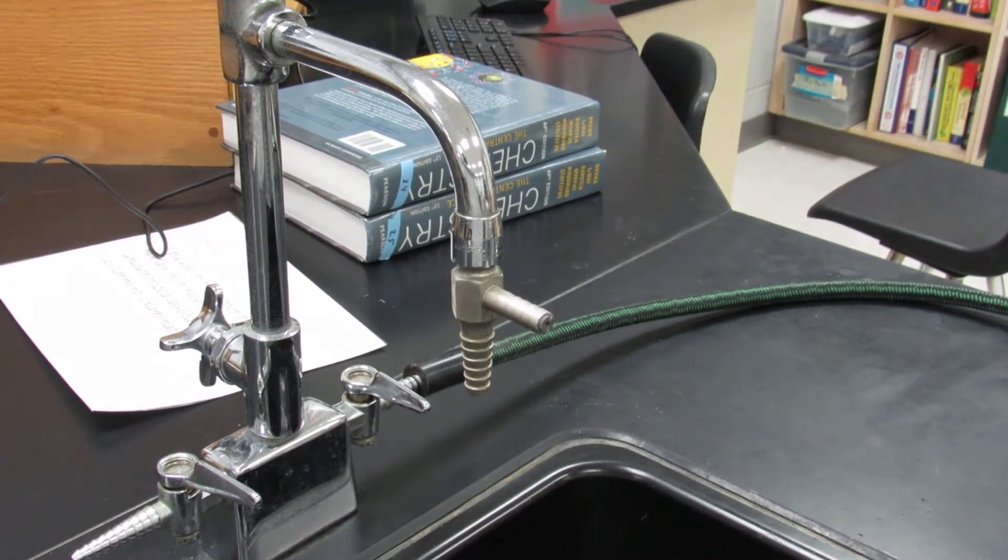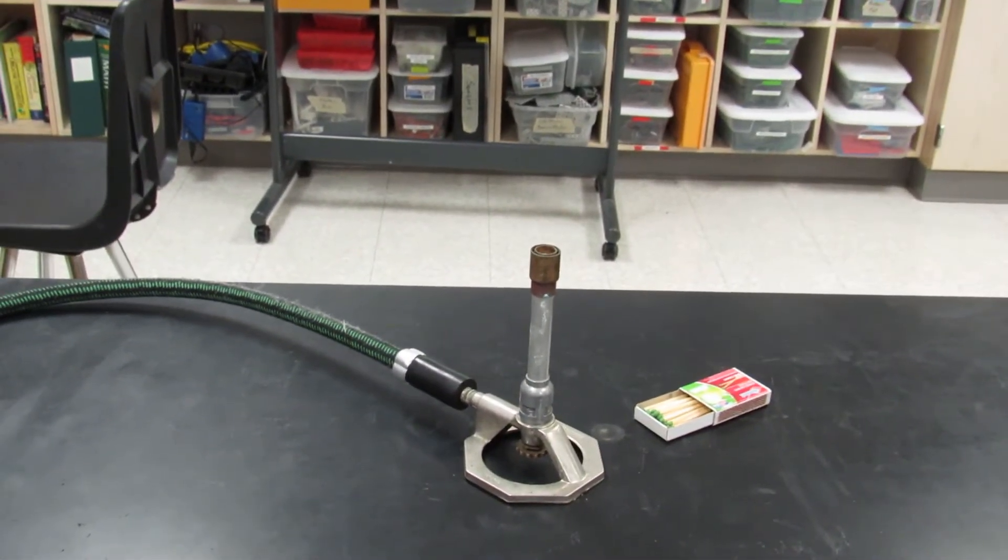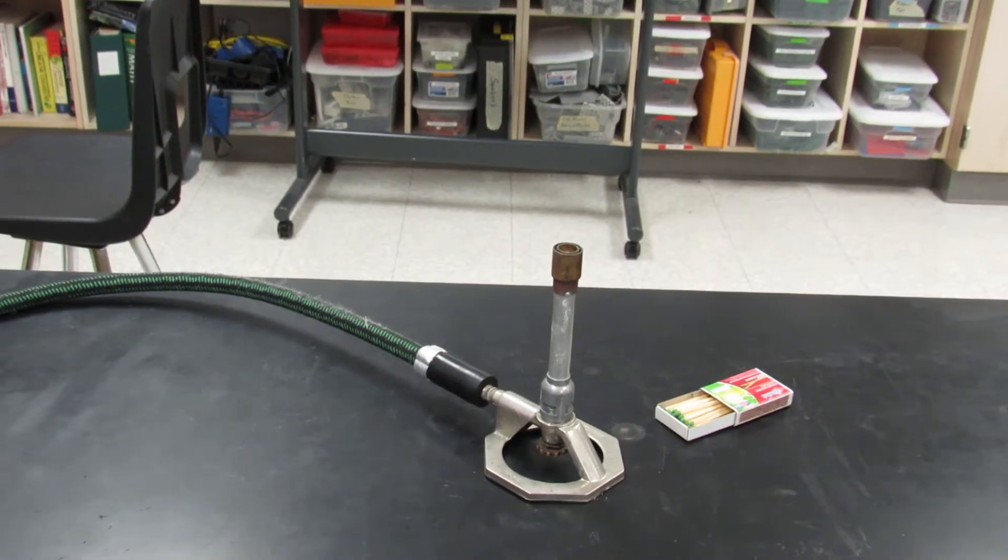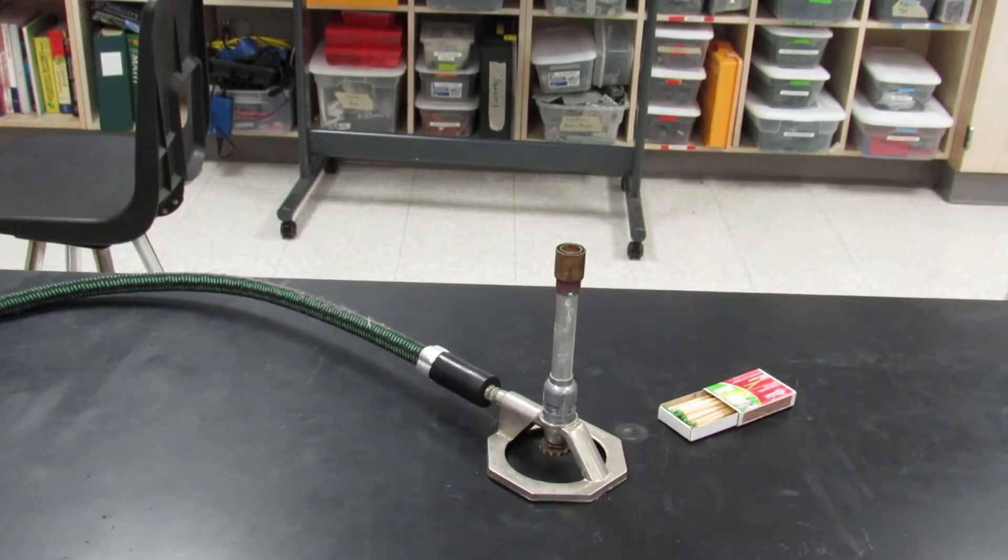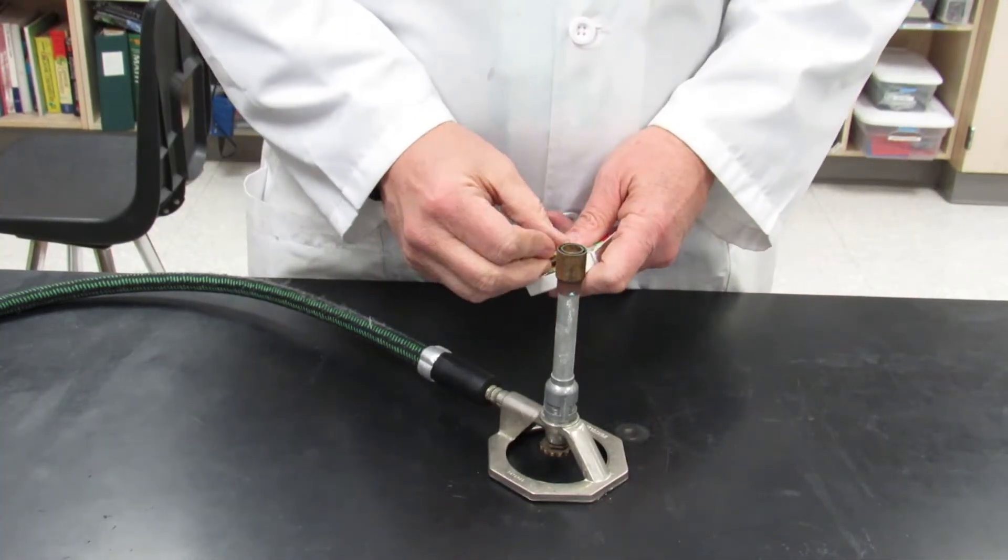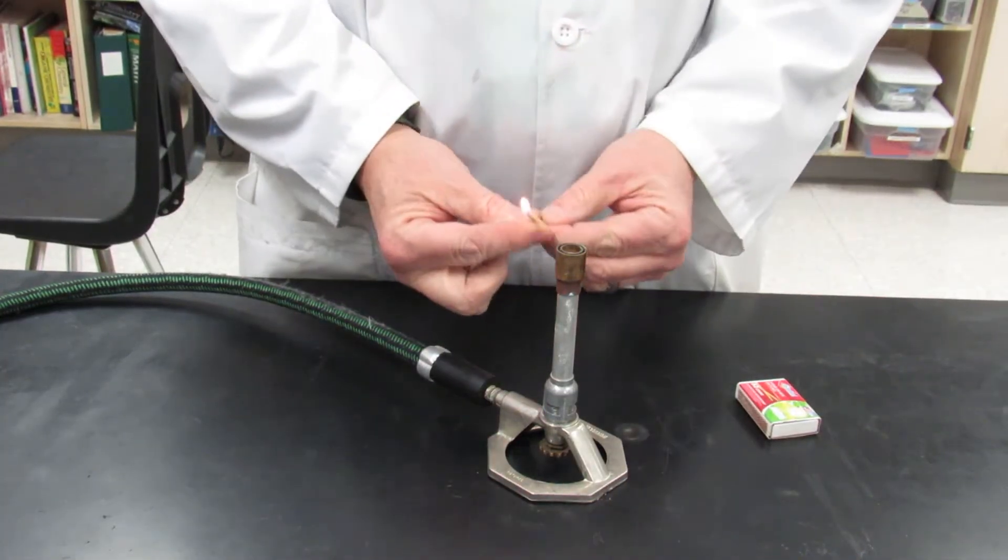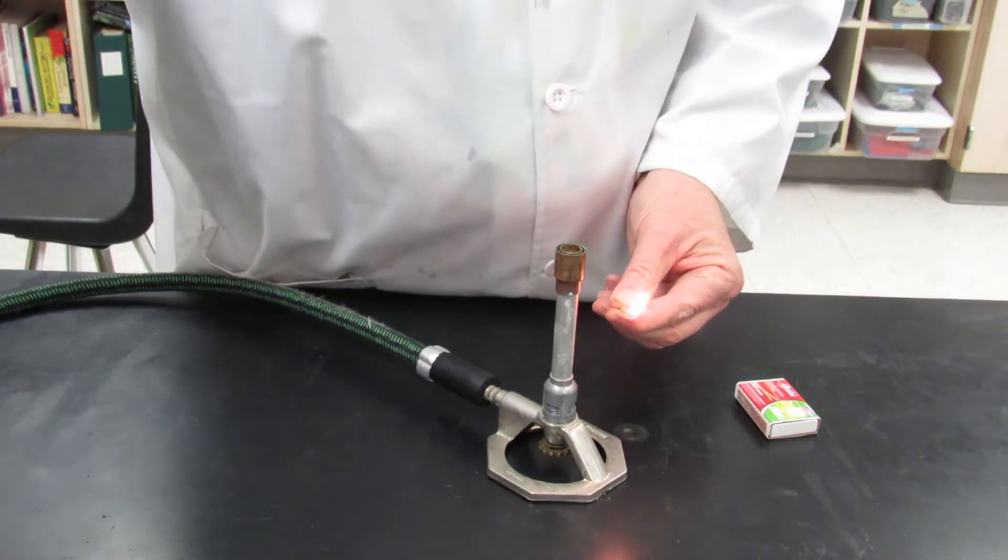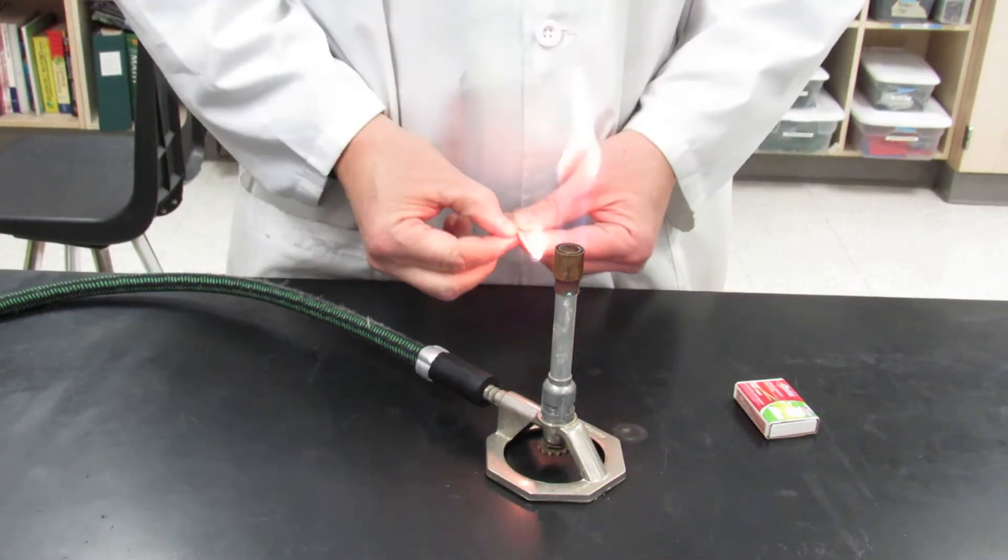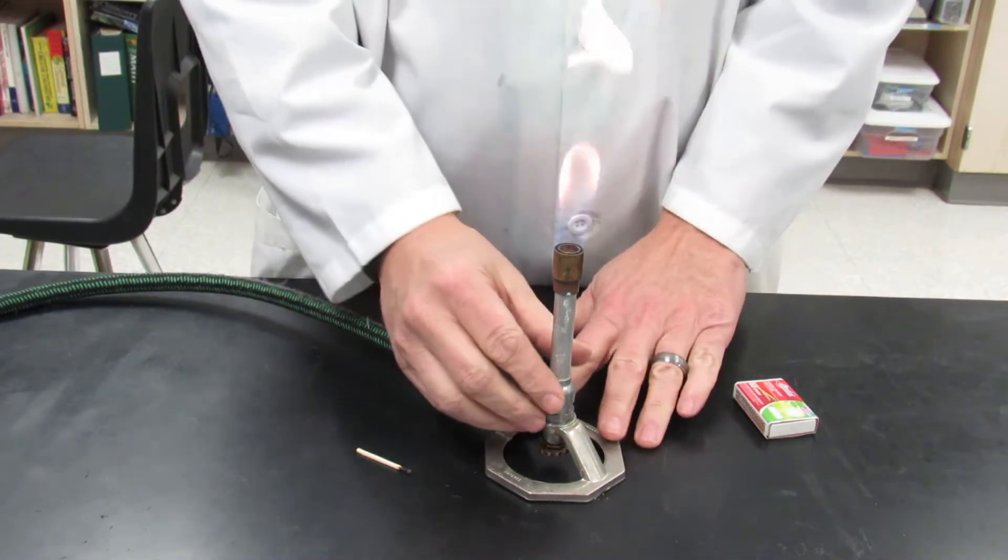Only adjust the gas to all on or all off. Next, strike your match first on the side of the box, then turn your gas on all the way. Run the match up the side, and you should have a flame. Blow out the match and set it aside. Now you need to adjust the flame.